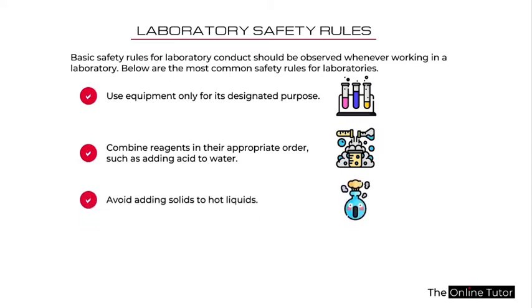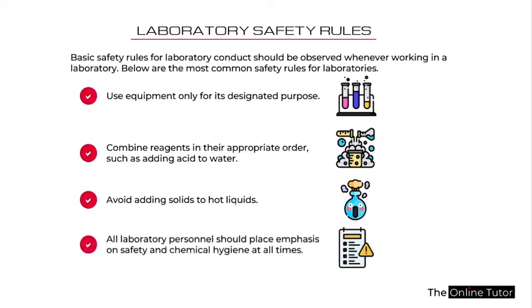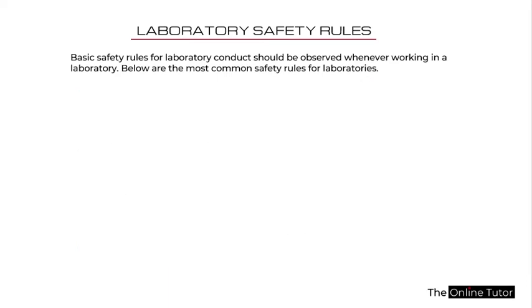You have to avoid adding solids to hot liquids. Like I said, adding any solid to any hot liquid all of a sudden can produce reactions that emit a lot of heat, and this heat can cause an explosion in the laboratory. So you need to avoid adding solids to hot liquids in the laboratory. All laboratory personnel should place emphasis on safety and chemical hygiene at all times. Your safety is very, very important. You don't want to carry out one experiment and have thousands of accidents and thousands of people getting injured in the laboratory. So emphasis needs to be placed on safety.